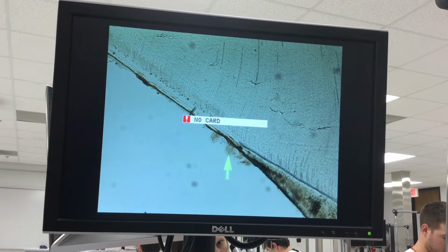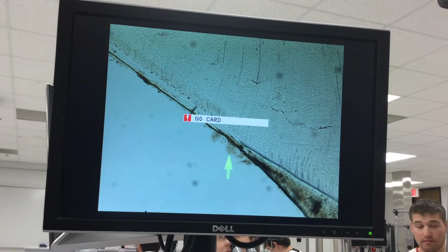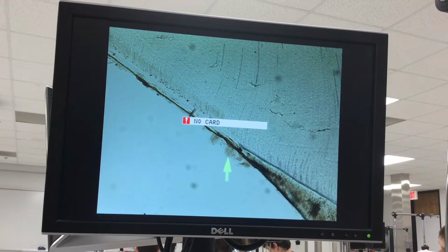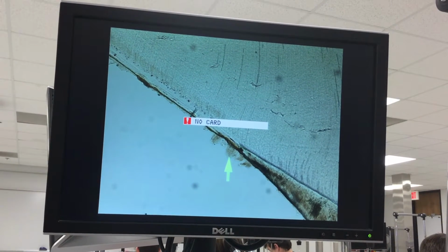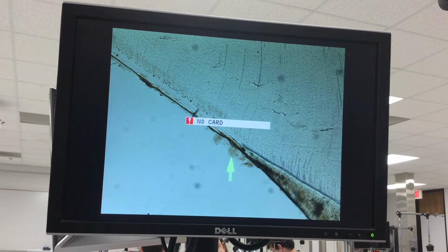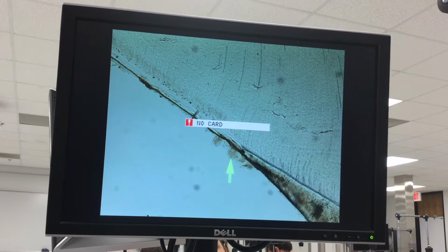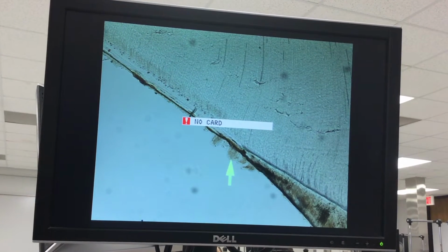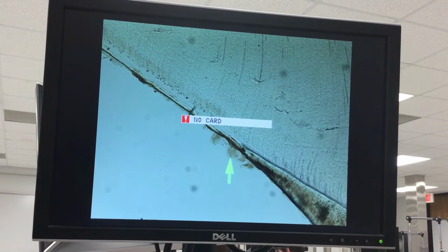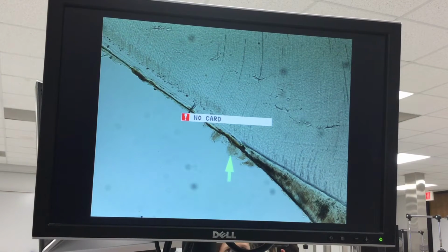have a considerable amount of cellular cementum. I mean, it's really good. The other one is a section showing incremental lines in acellular cementum. And we'll show that slide again next week because there's also some cementicles on that slide. So we'll look at that when we do the PDL. So look at both ground sections and also demineralized sections today for the cementum. And of course, look at more than one slide.